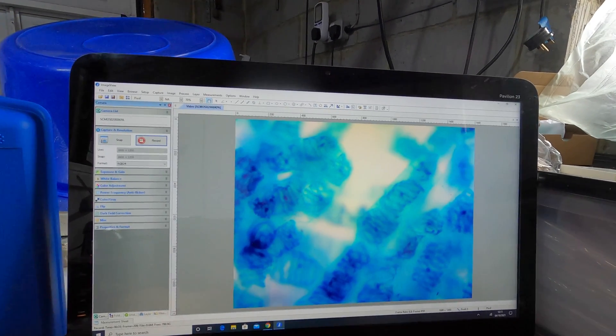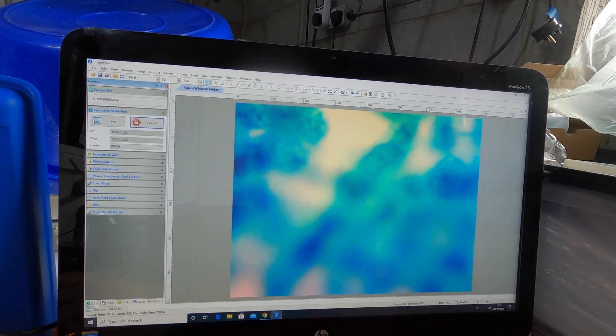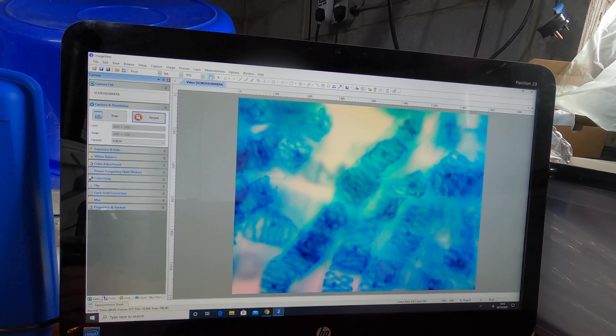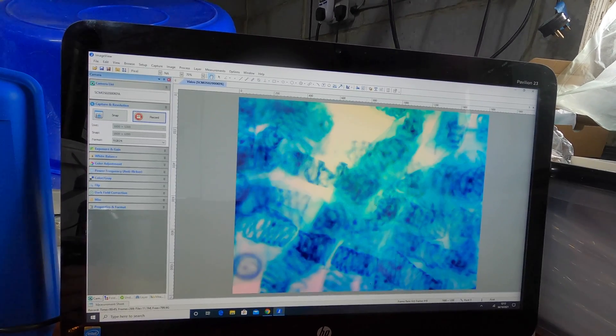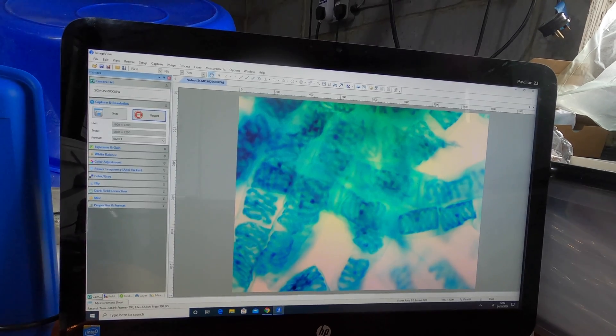Now we'll zoom in a little bit more — just flicking the dial around. This is on 100x and we'll try and focus in on that. You can see the fine-tuning you can do; you can really pick up some detail.